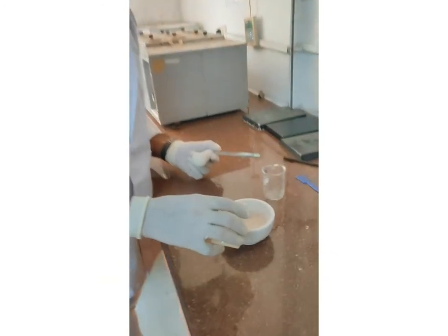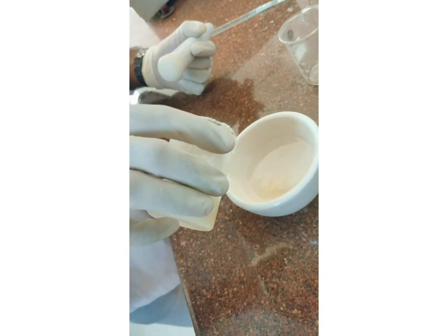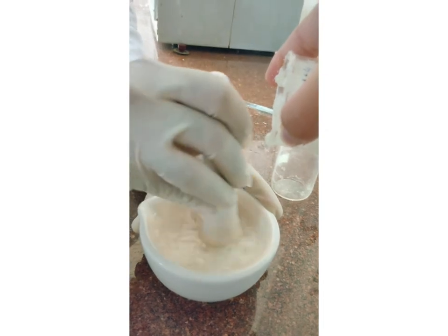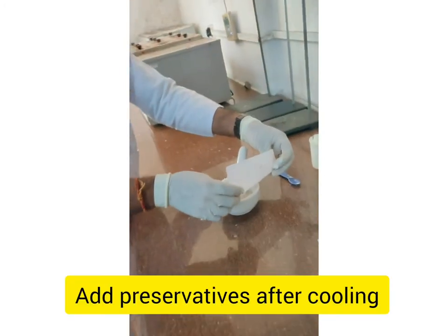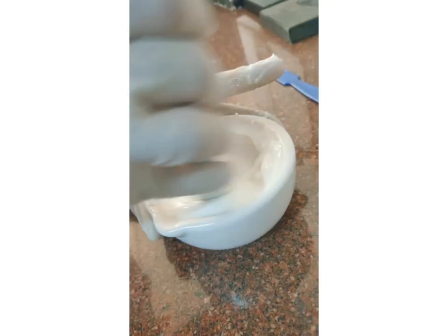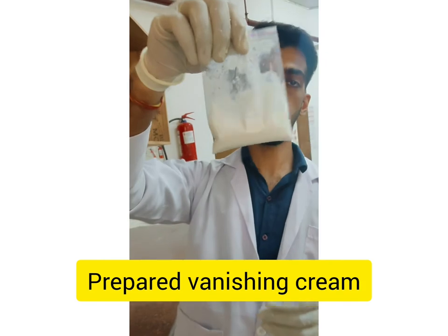Now we will add the oil phase into the water phase dropwise and mix them. Now we will add our preservatives, methylparaben and propylparaben, as you can see, after cooling down. Now we will mix them. As you all can see, we have prepared our vanishing cream.